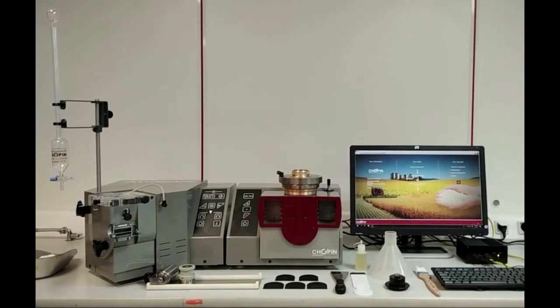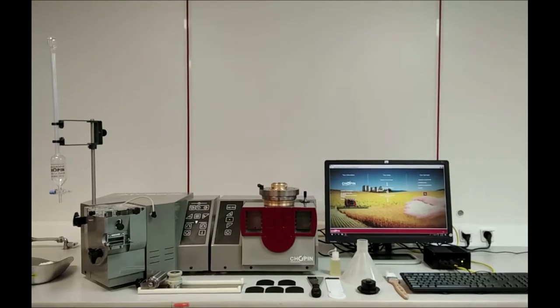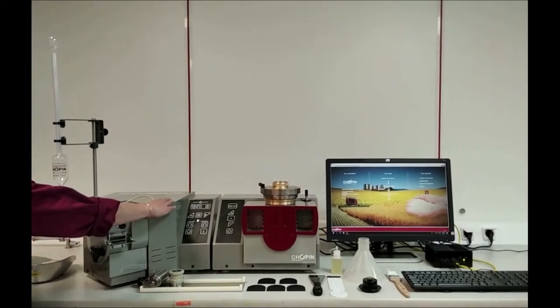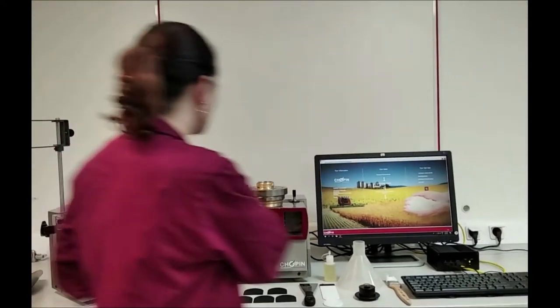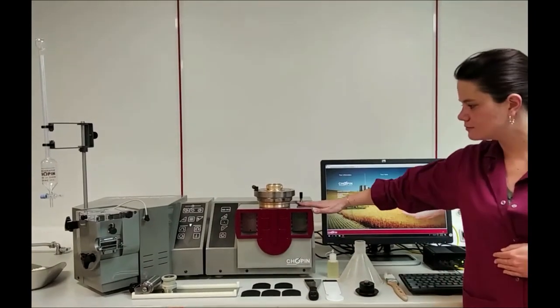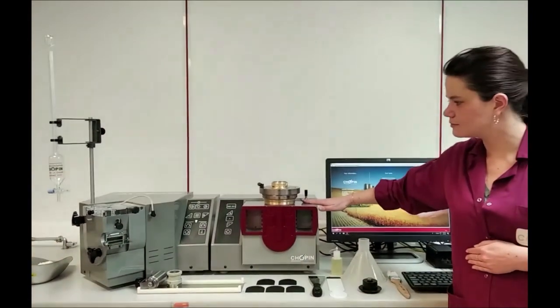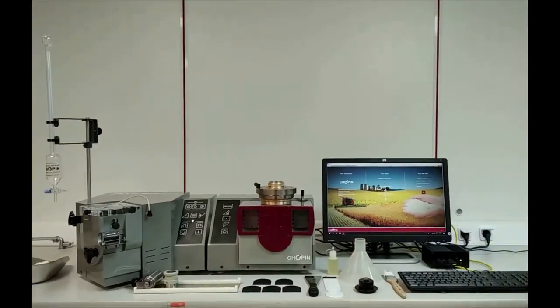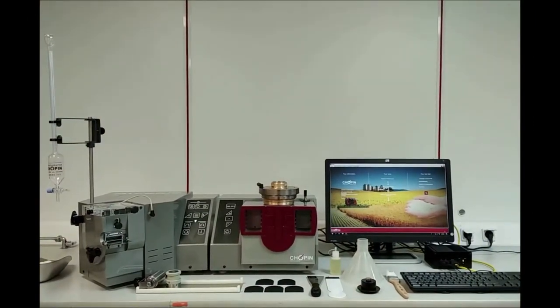The Alveo PC is always composed of two inseparable parts. The kneading machine for dough sample preparation, and the alveograph itself where the dough patty is deformed into a bubble until it ruptures.